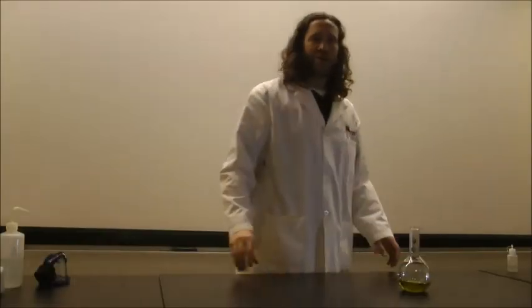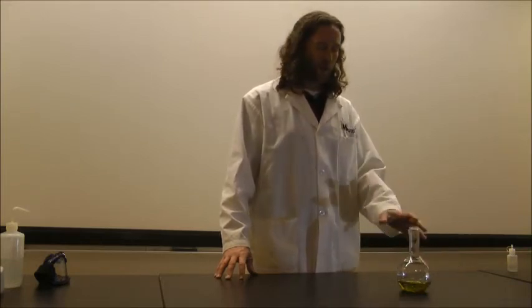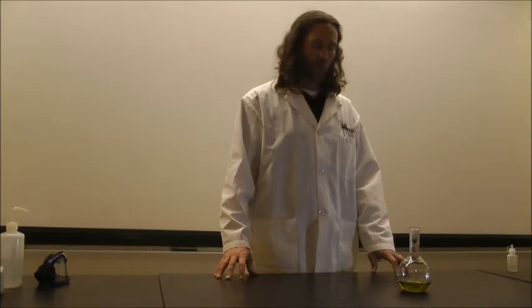The chemistry behind this transformation is pretty straightforward. Whenever I breathe out, I'm breathing out carbon dioxide. When carbon dioxide dissolves into water, it becomes an acid. So just by breathing into water, we can take it from a basic solution that was shown by the blue color of our universal indicator, and then we can lower its pH, we can make it more acidic until we get to this yellowish solution.